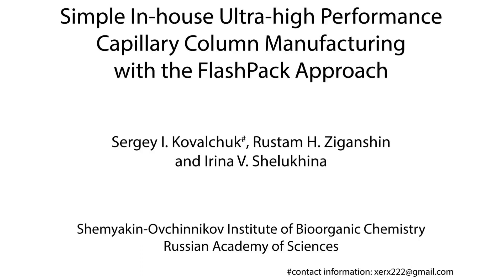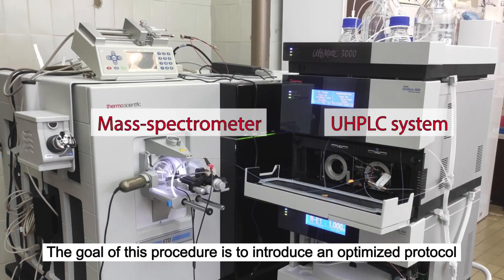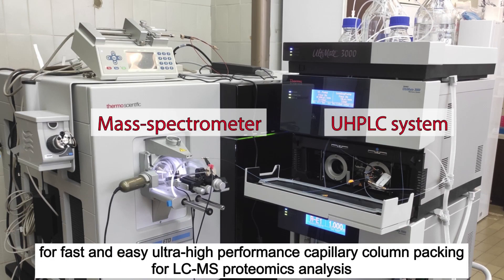Simple in-house ultra-high-performance capillary column manufacturing with a flash-pack approach. The goal of this procedure is to introduce an optimized protocol for fast and easy ultra-high-performance capillary column packing for LC-MS proteomics analysis.